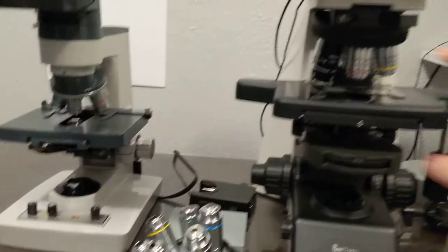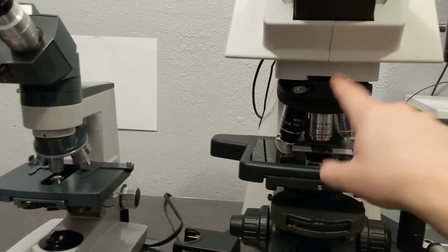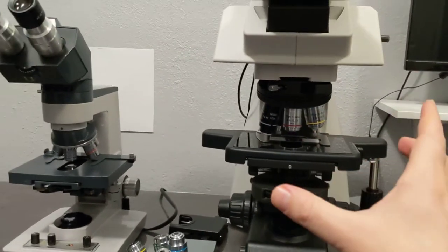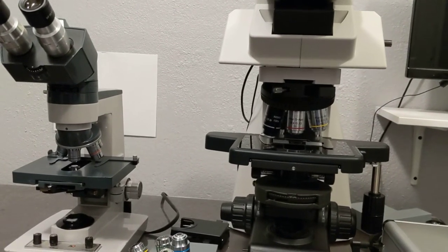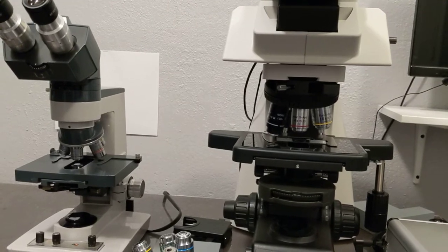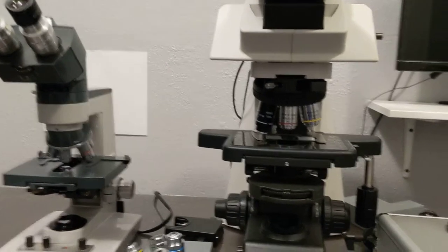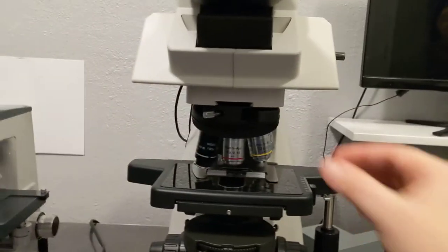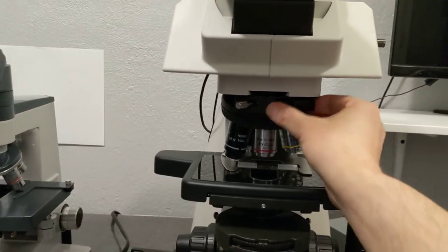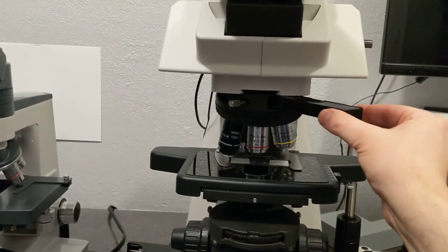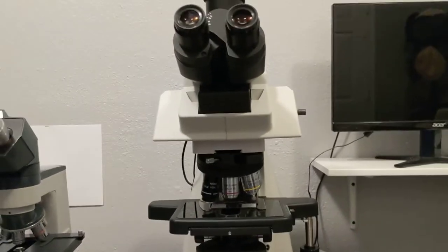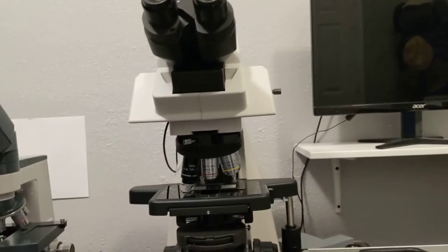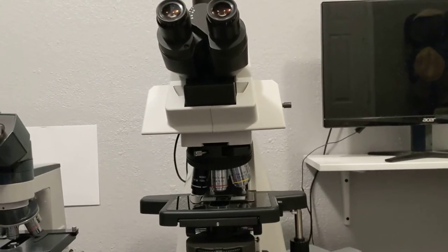The nose piece has a 40-millimeter dovetail, which is different. The Nikon CI has a 50-millimeter dovetail, so it's not compatible. You'll see it's got this slot for something to be inserted. This microscope uses that heavily. I've got an analyzer that'll go into that spot, and the DIC system uses that as well.